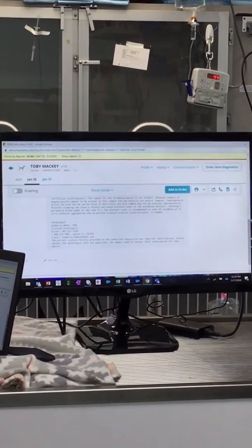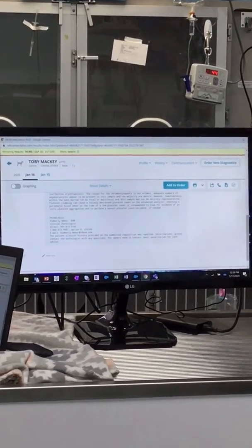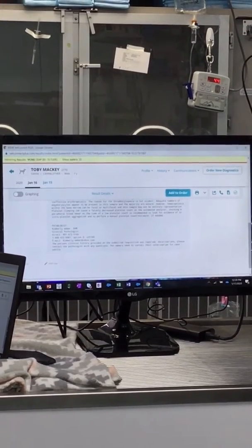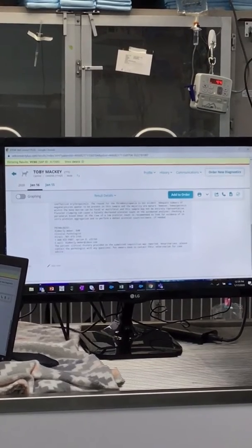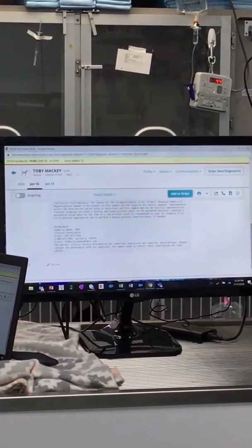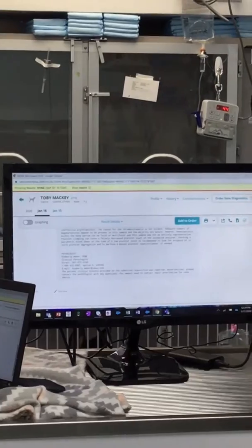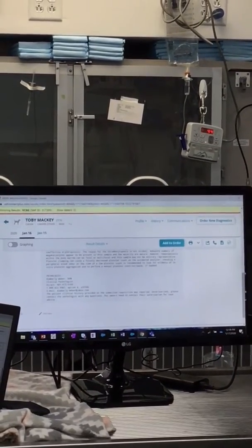So extremely important, and you don't think about it, but if that happens, if you're going to send them in, totally fine. Put them in a different bag. Formalin actually will affect the slide, making a blue haze on it, and the pathologist can't read it. That happens a lot more than you would think. So if for some reason they feel absolutely, take 10 slides if you want, but put them in a different bag, just so that it doesn't get that cross contamination.